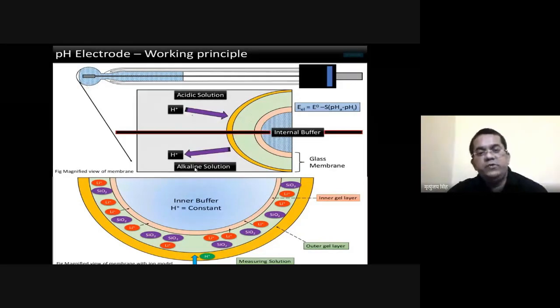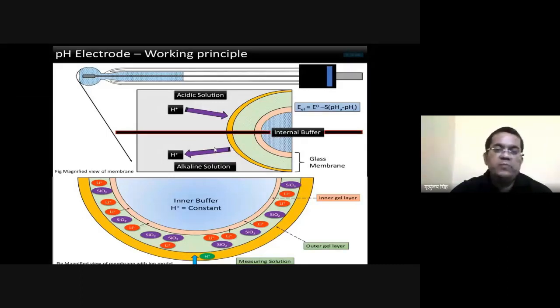And if you are using alkaline solutions, the hydrogen ion is coming from the bubble, because internally the bubble contains buffer solutions which interact with your chemicals and try to neutralize it.